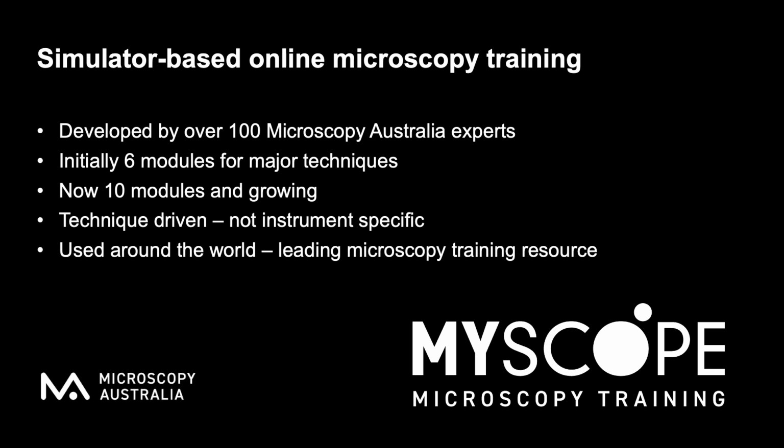Now, the simulators are really at the heart of MyScope. They are technique driven, they're not instrument specific. So we didn't want to be just putting up interfaces for specific instruments or from specific vendors. We wanted people to understand the concepts for the techniques that they need to be understanding controls of. So we've got a very generic interface, but that is typical of what we want beginner users to learn.